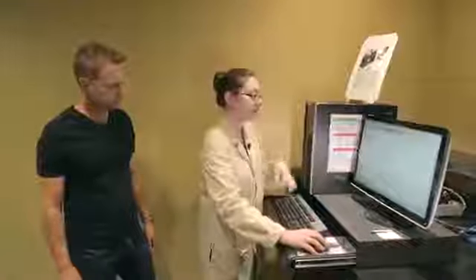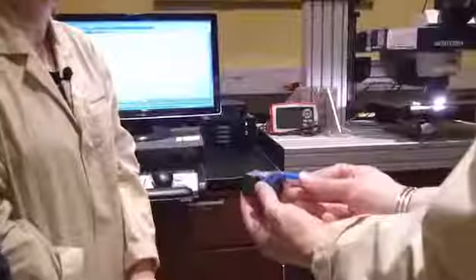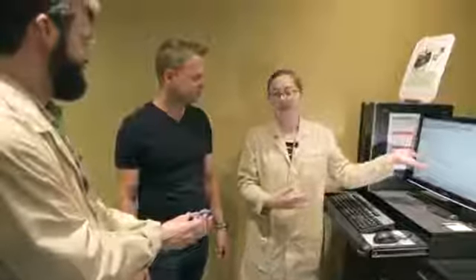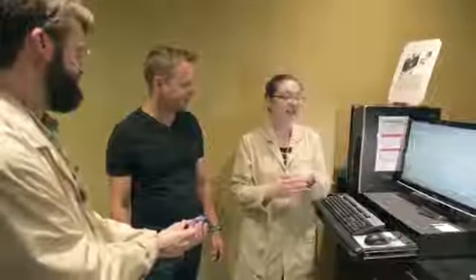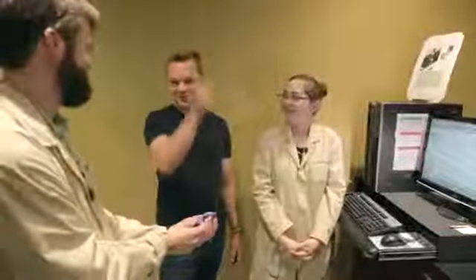And then after doing a library match, we see that we have an amazingly good match with the reference spectrum here in pink, and that's for ultramarine. It really is a very clear... Oh, like exact match? Yes, almost. And so our spectrum is coming from a synthetic version of just the blue. Gotcha. But we can tell that it's synthetic, and that's interesting because it wasn't synthesized until 1826. Oh, wow. So... Okay. That's like a huge red flag.